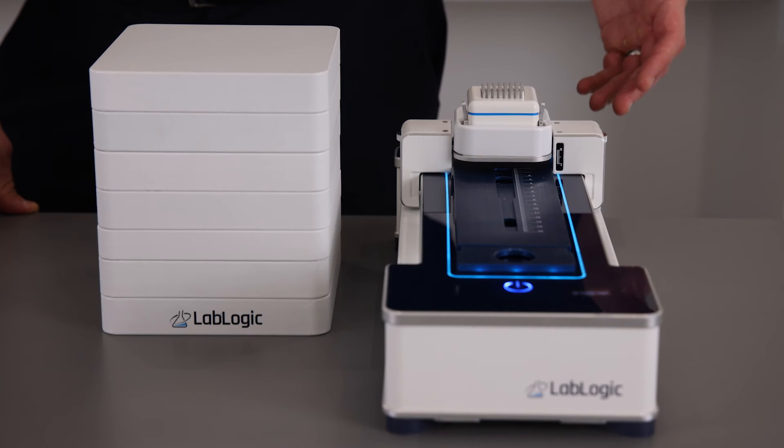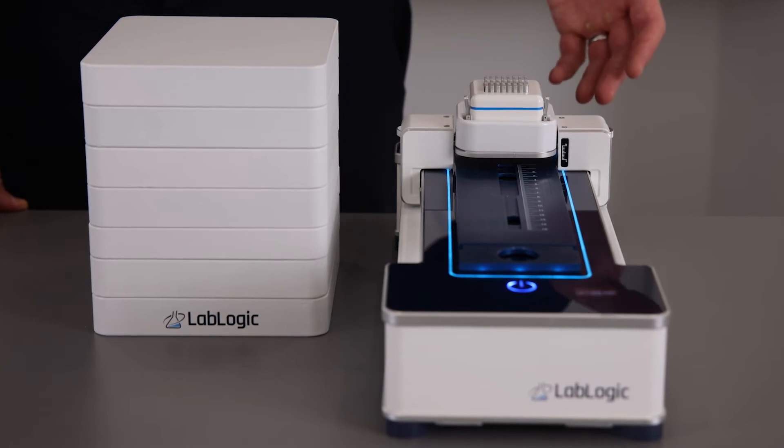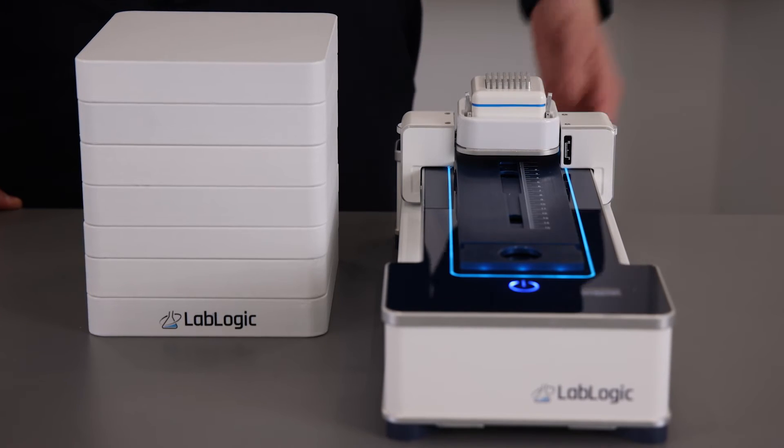The DualScanRAM consists of a single radio TLC detector and a radio HPLC detector in the same system, saving you valuable bench space.